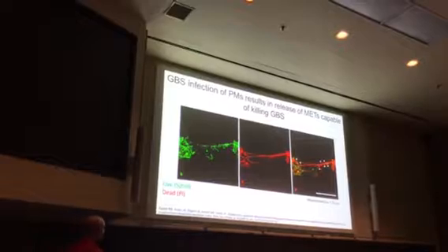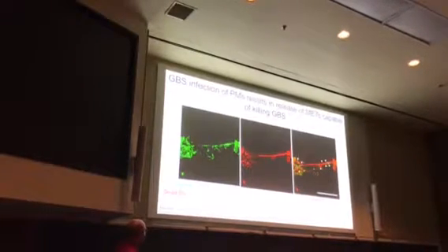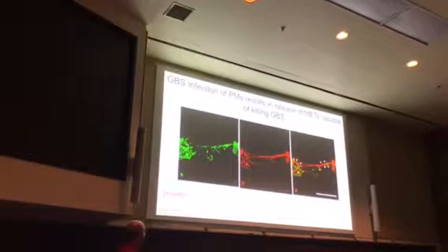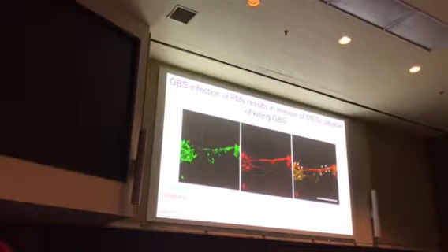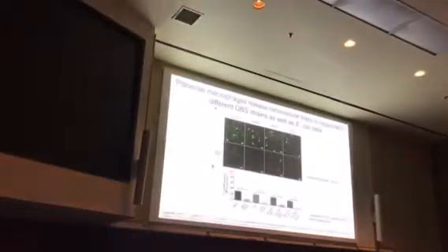When we look at the overlay, what I hope you can appreciate is those cells that seem to be dying seem most closely related, as far as distance, to the extracellular trap fibers, where you can have single dead bacterial cells within a chain of live ones that seem to be associated with those extracellular traps, suggesting that there is some degree of bactericidal activity there.